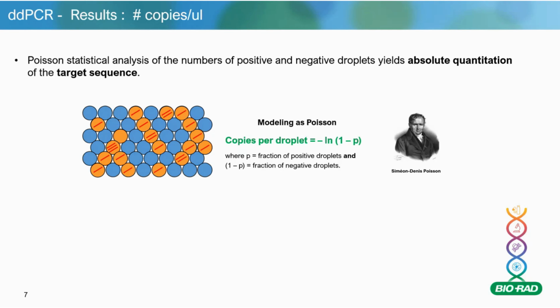And if I had to add another 10 tables, I wouldn't be so accurate, but I probably wouldn't be far off. Now, if I had a sample size of around 20,000 tables, then I could more accurately predict the likelihood of having 1 or 2 or 3 people at each of the tables going forward. It's just a method of fitting the data.